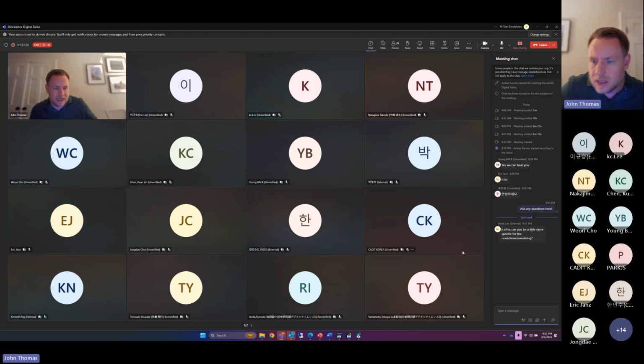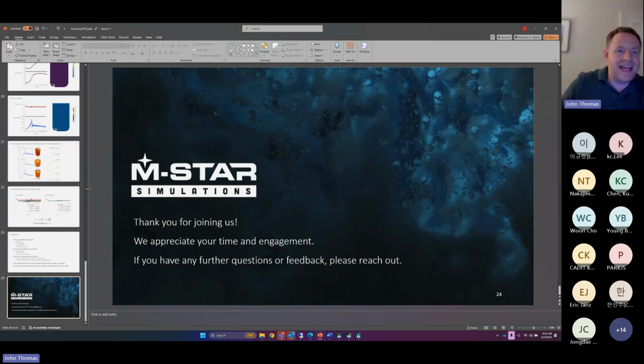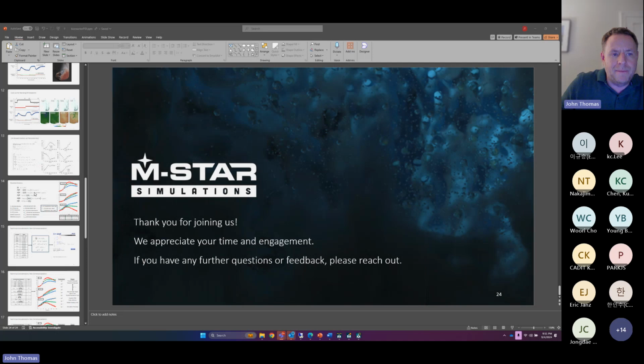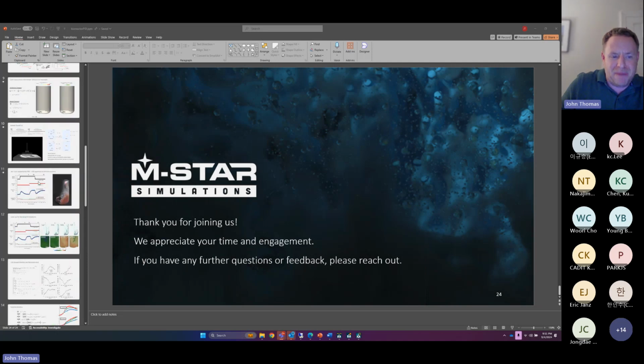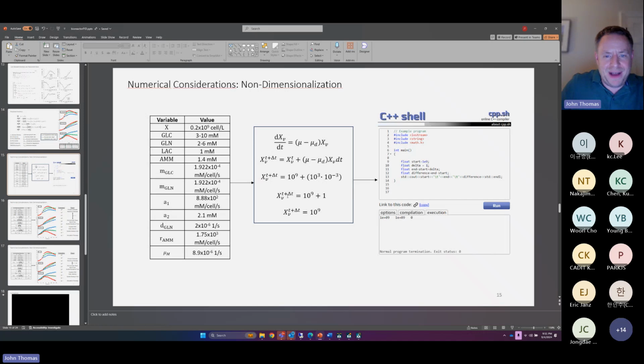We got a question, I think. Great question, thanks for that. I breezed through this, and it is a topic that deserves a little more discussion. It's an important point, and admittedly a very computer science point, but it comes down to doing math on a computer. Take a look at this here.